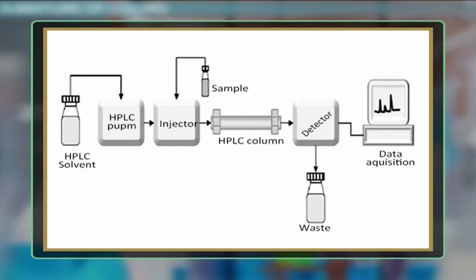The mobile phase is an aqueous buffer where both pH and ionic strength are used to control elution time. Instrumentation. HPLC instrumentation includes a pump, injector, column, detector and integrator or acquisition and display system. The heart of the system is the column where separation occurs.